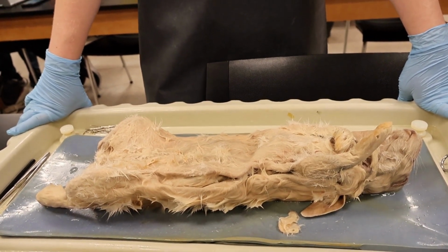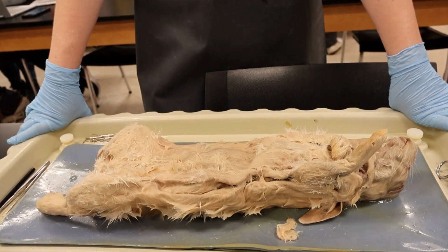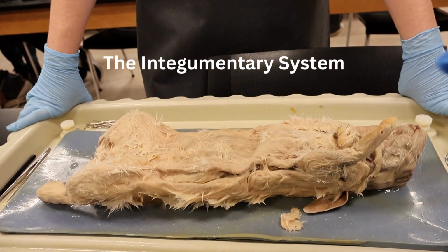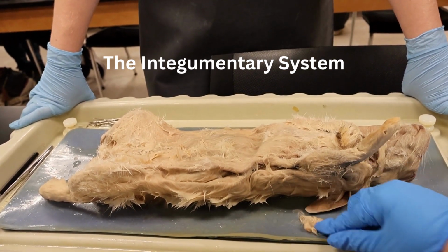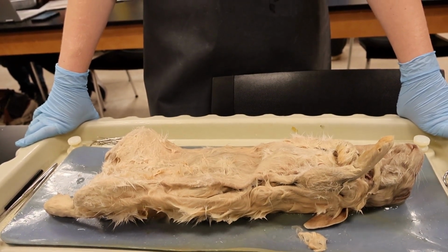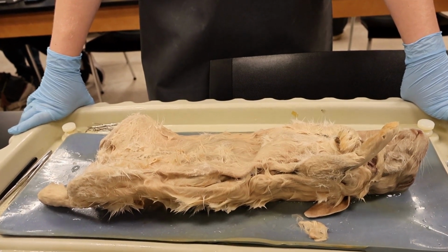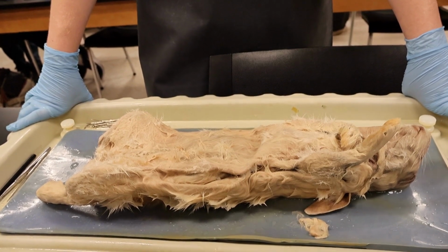The first system we're going to discuss and show on this recording is the integumentary system. First off is the hair of the rabbit. We did cut off some here as shown. The hair of a rabbit is used for warmth and as an external barrier between the epidermis and the organs, as well as, in some species of rabbits, for camouflage, among other adaptations.